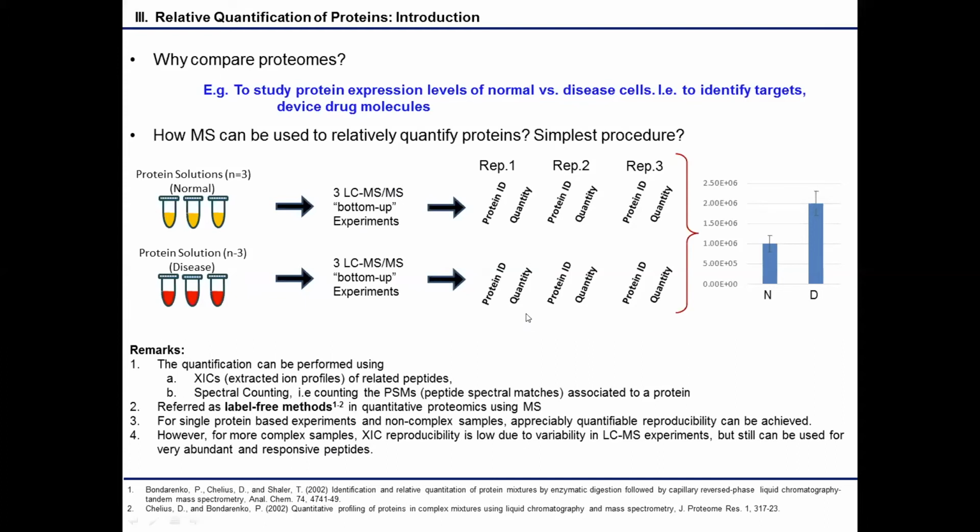All right, this is a classic question for you, Aruna. Yes. So why would you use mass spectrometry to check expression levels when there's Western blot and protein microarray? Is it because it gives more information? Yes, it does give more information.